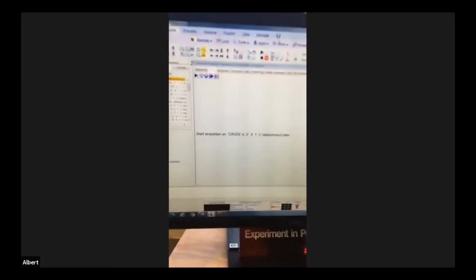I felt like I was on a spaceship. I was pushing buttons, turning knobs. But now you don't have to do that, right? So it's going to shim automatically.